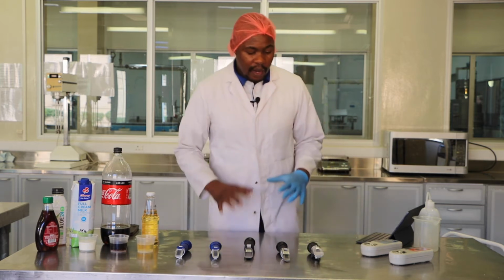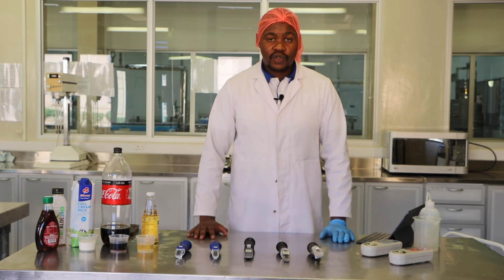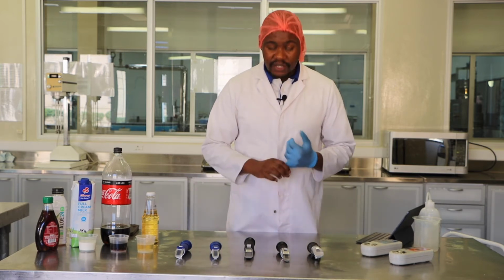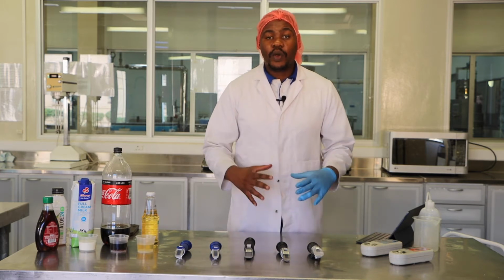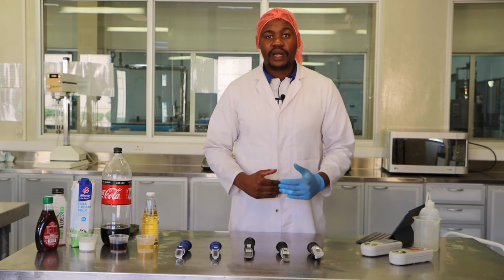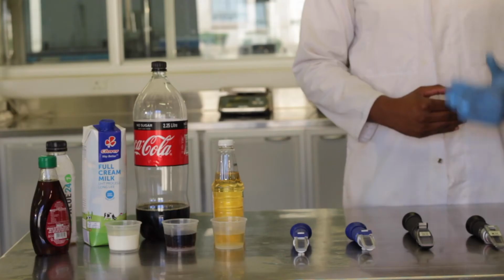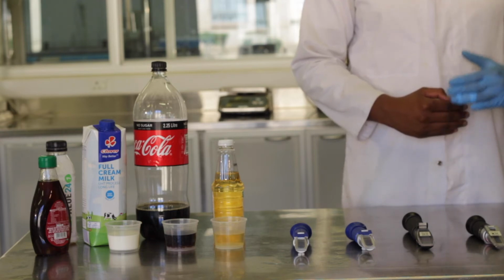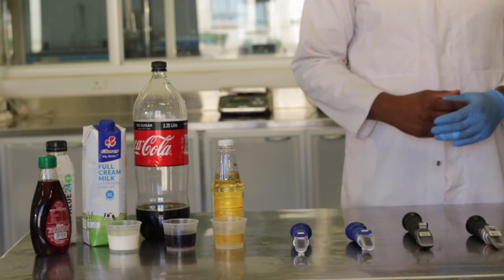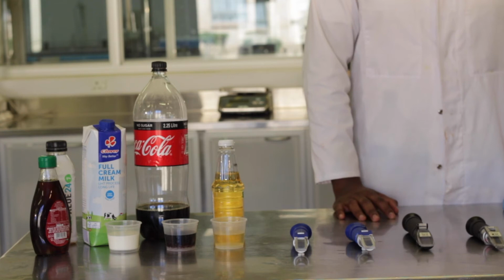Now, what are the things that we need to take into consideration when you are going to operate a refractometer? First of all, a refractometer must always be clean before you even begin to do your analysis. Make sure that your refractometer is rinsed or cleaned with distilled water, and then you measure the reading of distilled water, 0 to 0. It should give you a 0 reading.